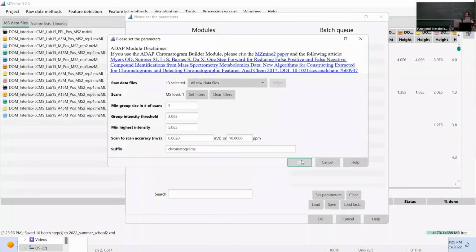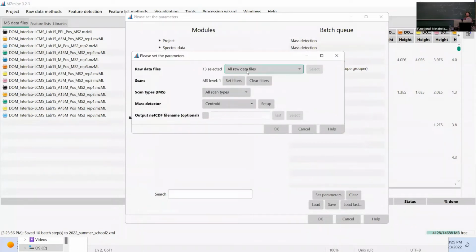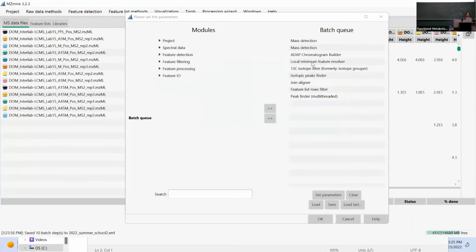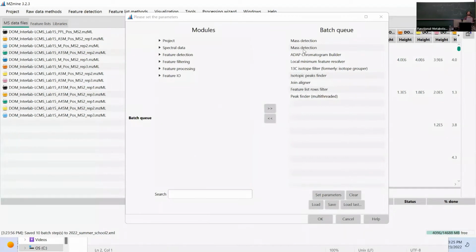Just make sure before you run the batch. Okay, so only the first 3.